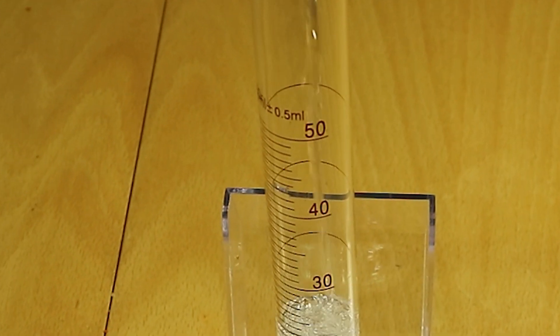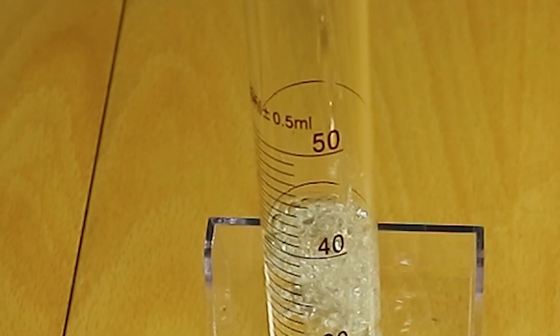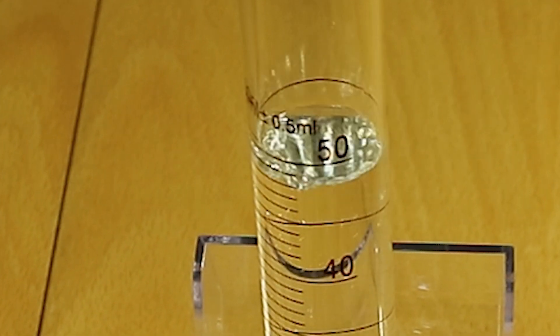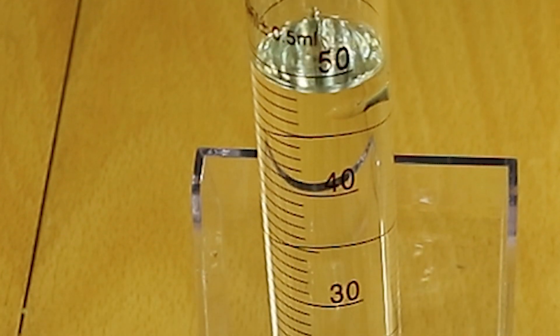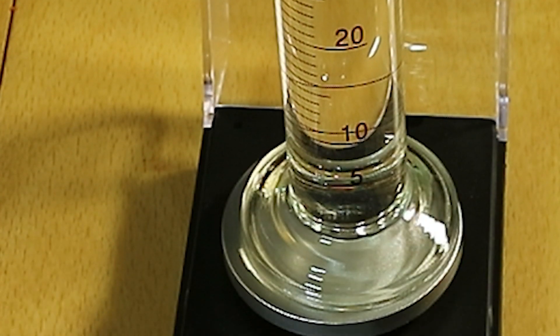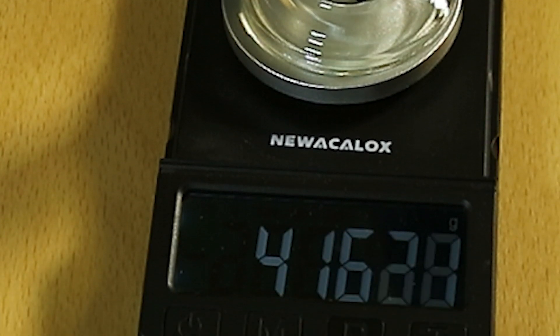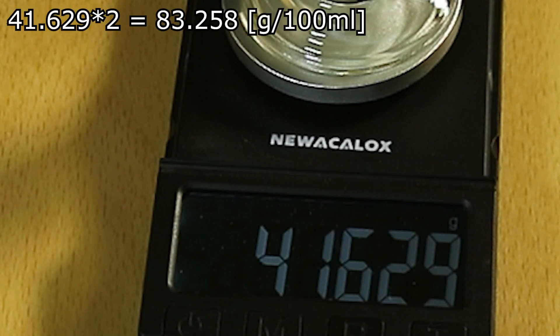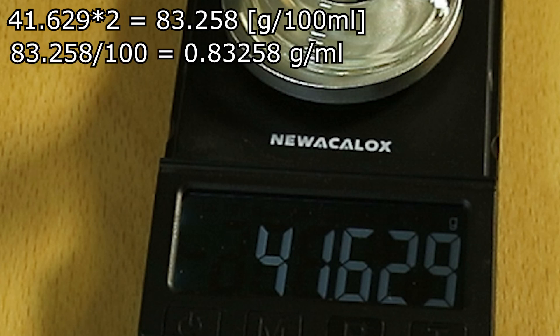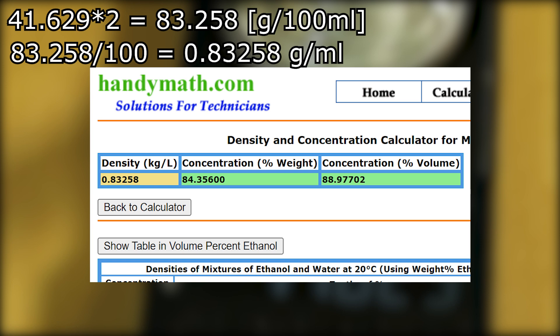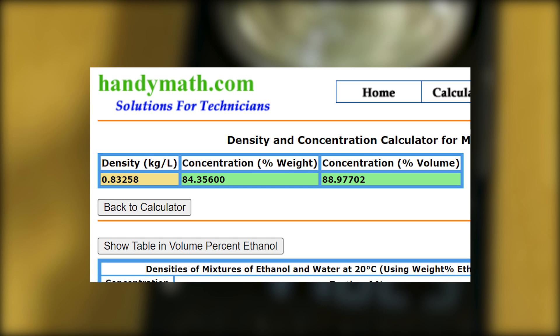We will now measure 50 milliliters of the mixture we got. The reason it's 50 and not 100 which would be easier is because my scale goes out of bounds with the graduated cylinder for 100 milliliters. So we measure 50 milliliters and we multiply it by two and check against the density table at 20 degrees which coincidentally is the exact temperature that my liquid was at so lucky. And we see that we achieved 84% ethanol which is good and I think that in the next distillation we would be able to reach 95%.